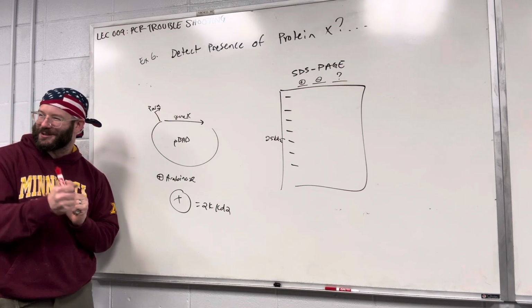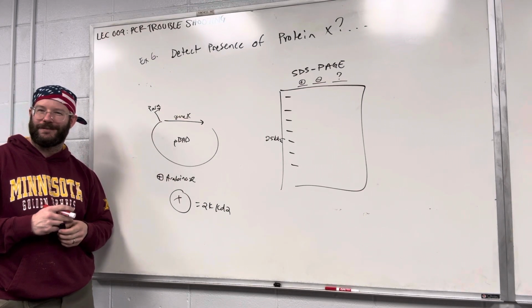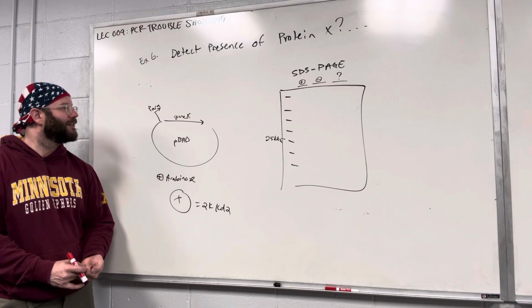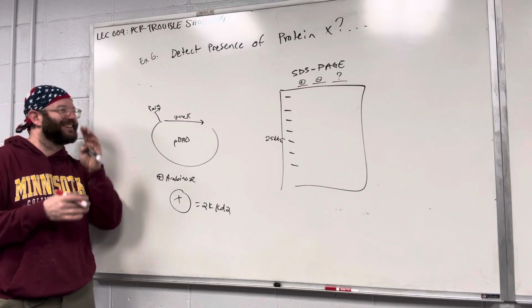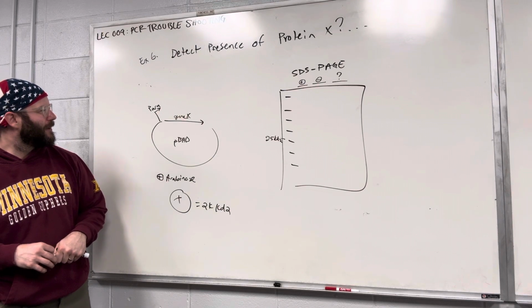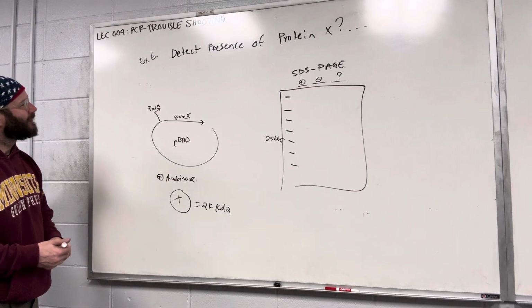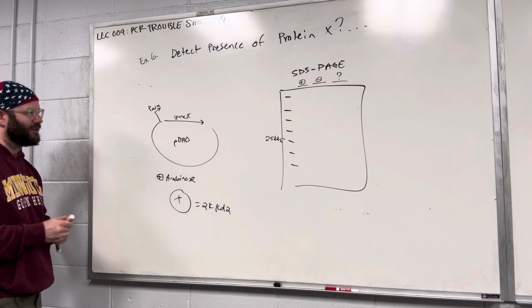Sometimes you have to build positive controls. Could you build a positive control? No guesses, even from you guys? Could you just have gene X in a plasmid already? Well, if you already had gene X in another plasmid, then why would you make a subtly different version of it? Would you just find a protein of similar size and run it? That's pretty close to what you might do.